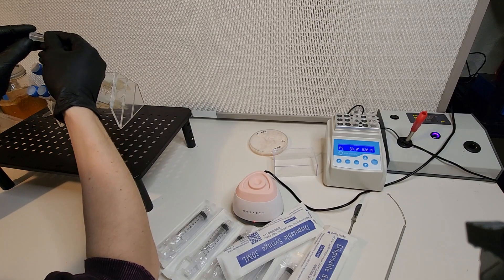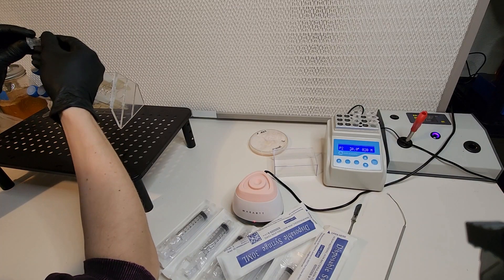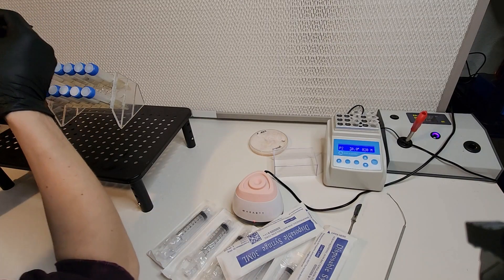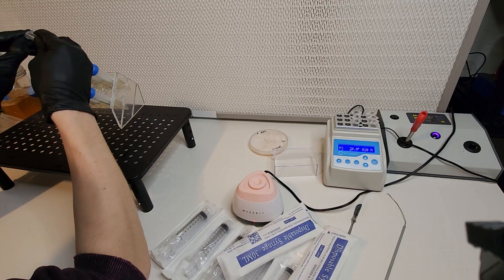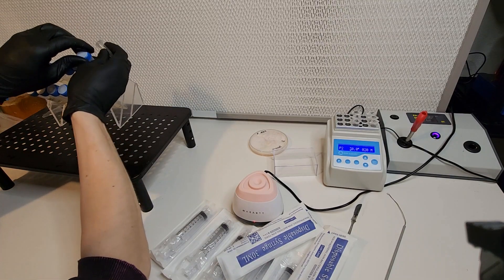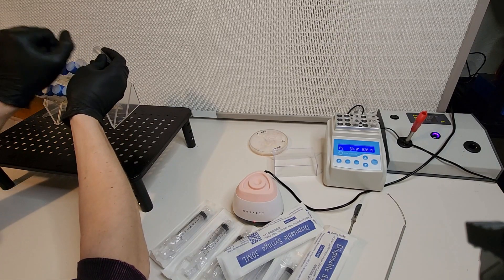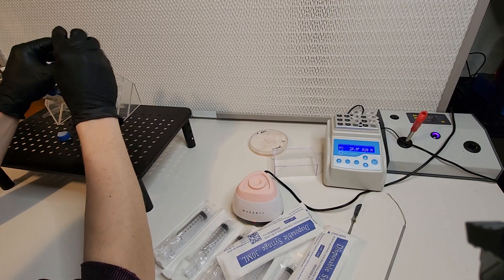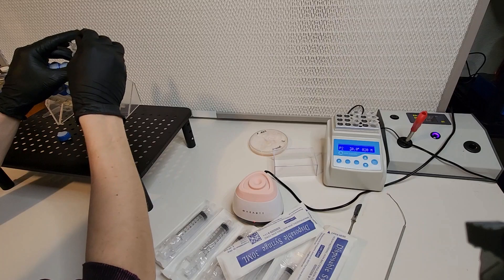The bioreaction tube is a 15 milliliter tube with an air filter on top to allow it to respirate over the week-long incubation period. Your samples after going inside of this tube will incubate for one week at room temperature up to 86 degrees Fahrenheit. Try not to let it go above that, otherwise it might shock the cells again.